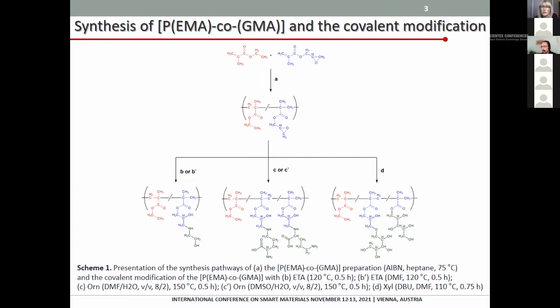The standard method for the preparation of methacrylic acid ester oligomers or polymers is based on a radical polymerization reaction initiated with AIBN, usually carried out in toluene solution, followed by precipitation of the resulting oligomers or polymer with methanol and further purification of the product. Herein, the reaction was performed in heptane solution, which reduces the dispersion of the obtained product due to the dependence between the length of the oligomeric chain and its solubility in the reaction medium.